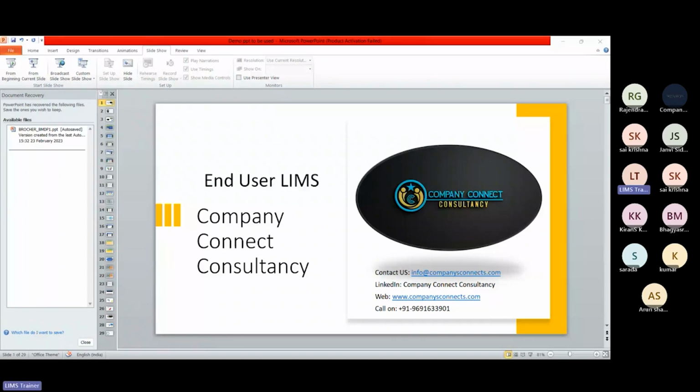And all the samples will be managed, and all the information that is related to that particular sample is collected into LIMS software. So it becomes easier to collect all the data related to a particular analysis. Understood? Yes. Now, the next thing is it improves accuracy. It gives reproducible results, and also in a faster way. And we can rely more on this software.